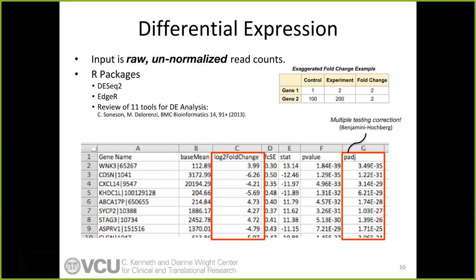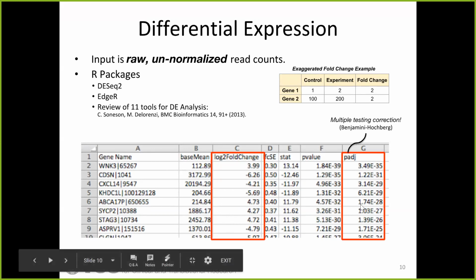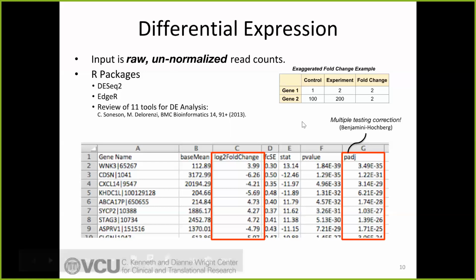So with RNA-seq data, filtering is based off of fold change level and p-value. I'll usually use the adjusted p-value, the fold change, as well as a base mean filter. So you can have a large fold change and a significant adjusted p-value, but a very low base mean. So anything with a base mean below 10, I usually just get rid of off the bat, regardless of p-value.